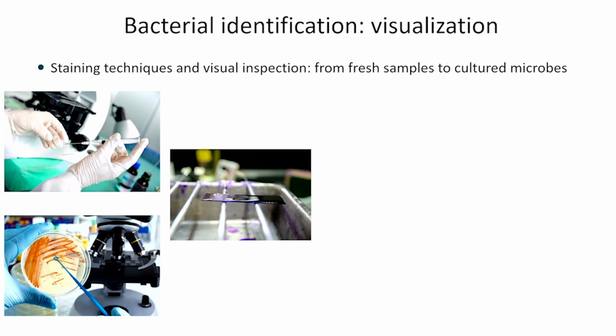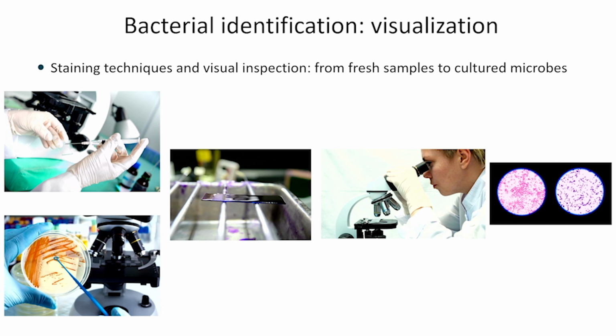And one of the things that we do is a staining technique. Some of these microbes can be stained. You can use a mixture of colors so you can see them on the microscope, and that actually gives you a little bit of information of who they are, right? So we employ the Gram stain technique, and we observe them on the microscope, and that gives us a direction on what we should do next in terms of growing them and identifying them.